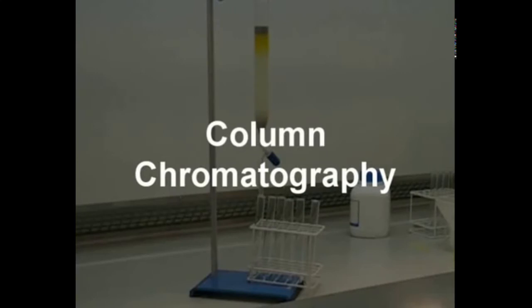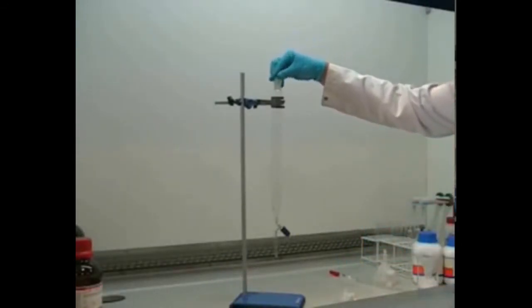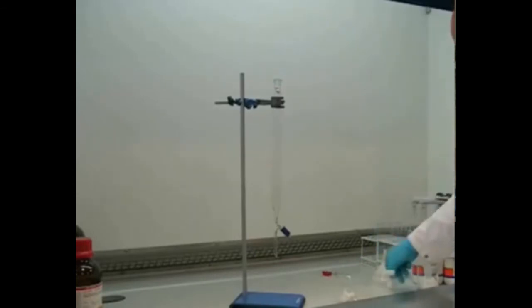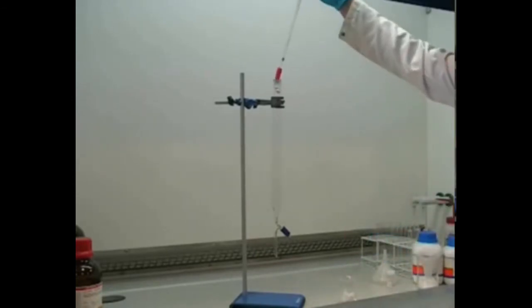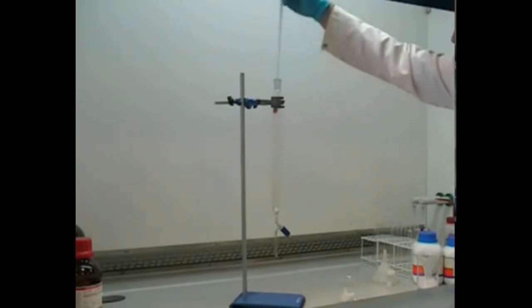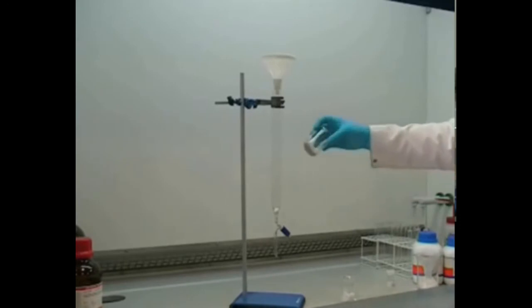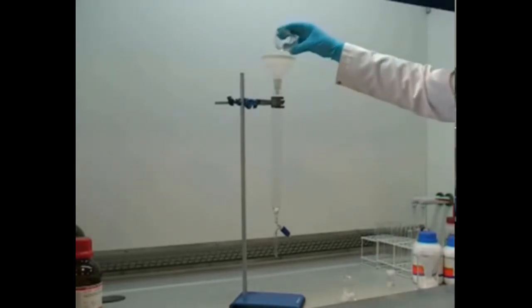This video outlines a method for carrying out column chromatography. You may be given slightly different instructions when you do this in the lab, but the principles will be the same. First of all, a small piece of cotton wool is placed in the bottom of the column to prevent solid material from going into the tap. Different columns may have different types of tap, but obviously the idea will be the same. Next, a small amount of sand is poured in to a depth of about 1 centimetre.